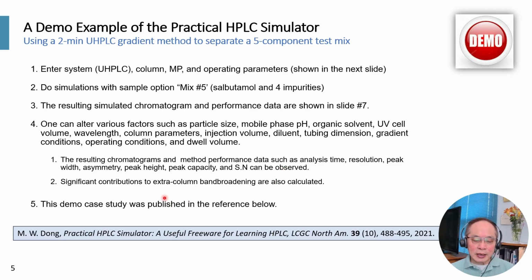Also, there's a window that shows you the contributions to extra column band broadening, so you can actually learn how to improve your separation later on from the simulated study.